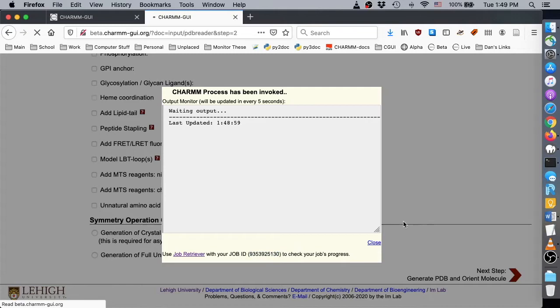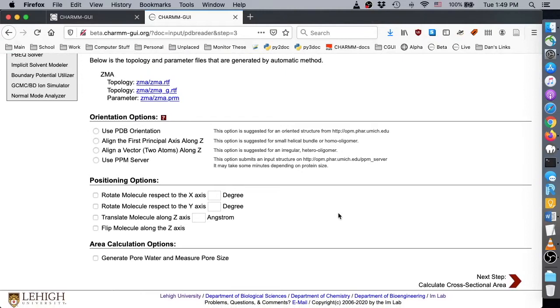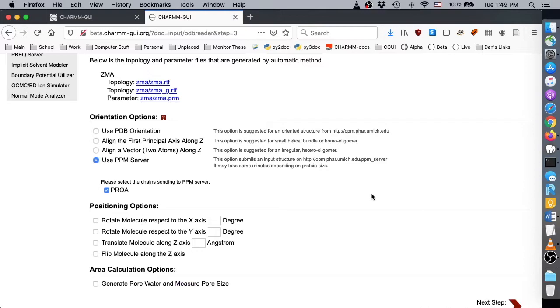On the Orientation Options page, we should note that the RCSB structure is not properly aligned for a membrane whose normal is along the z-axis and whose center is at z equals zero. We can check the Use PPM Server option to position this GPCR in a bilayer. Then click Next.